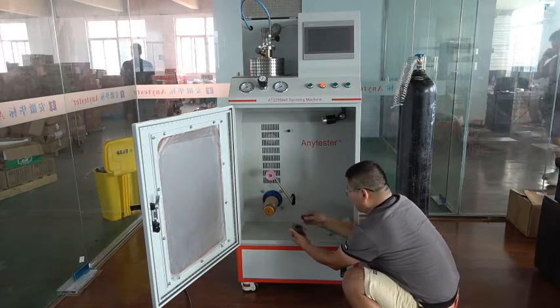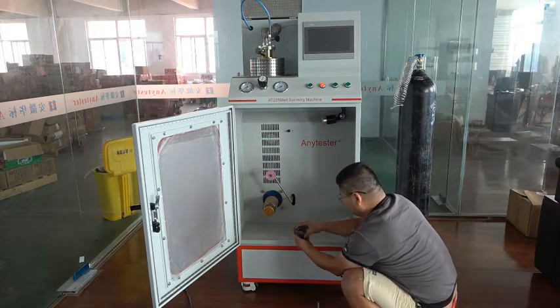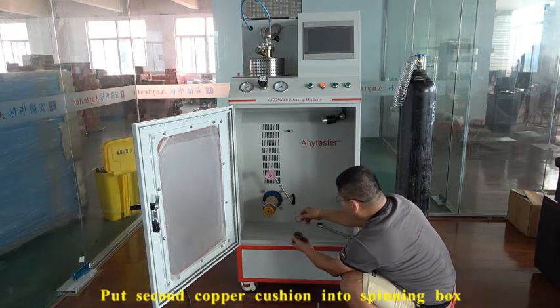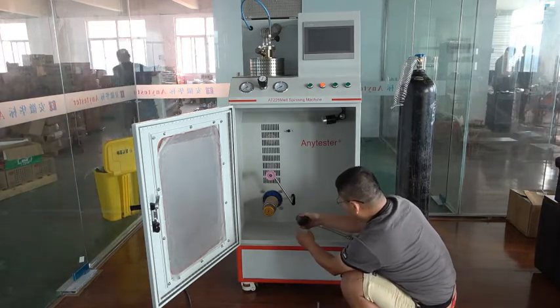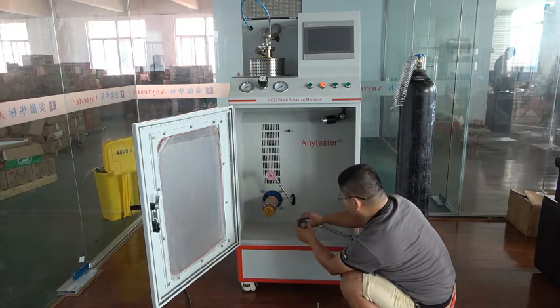Now put it into the spinning box. The other cover cushion. Now those accessories are mounted into the spinning box.